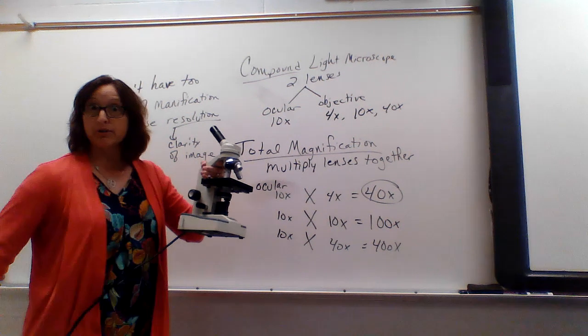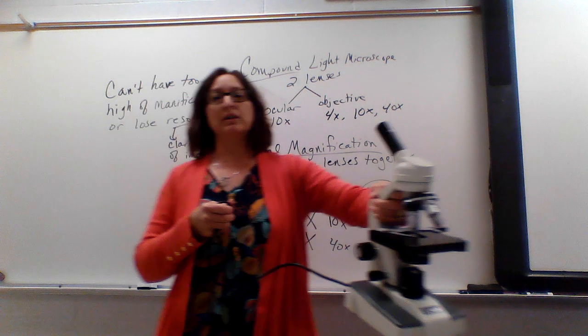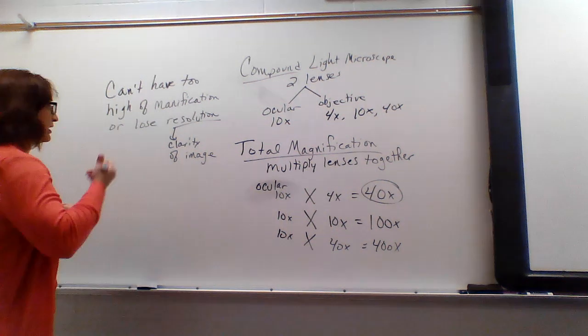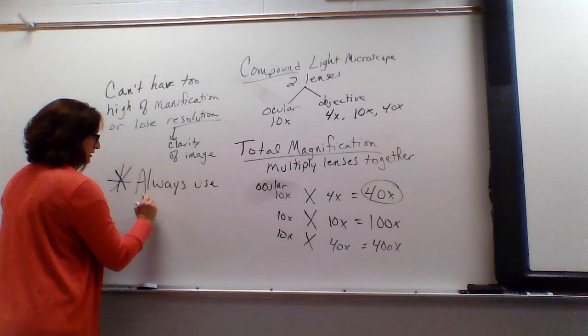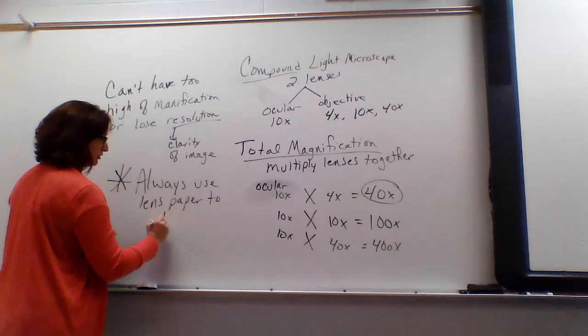Okay, so always use lens paper. We're not going to use your shirt or anything to clean the lenses, because that could scratch them. So, you know what? Write that down. That's very important. Always use lens paper to clean your lenses.